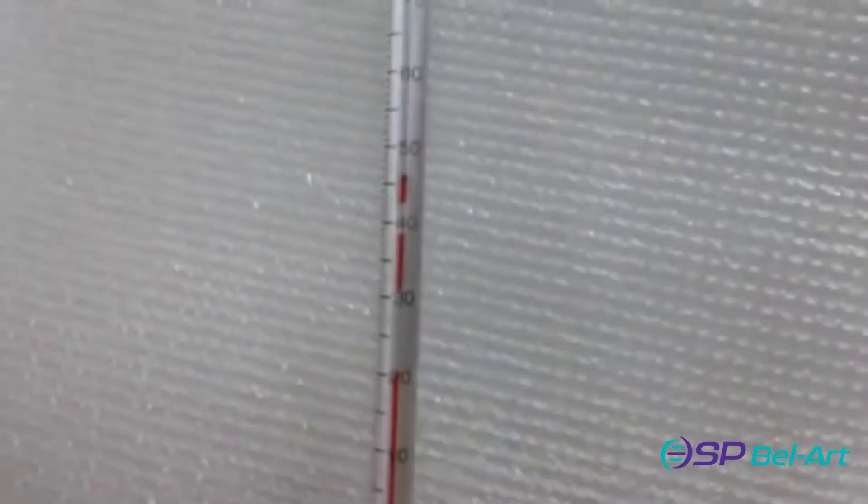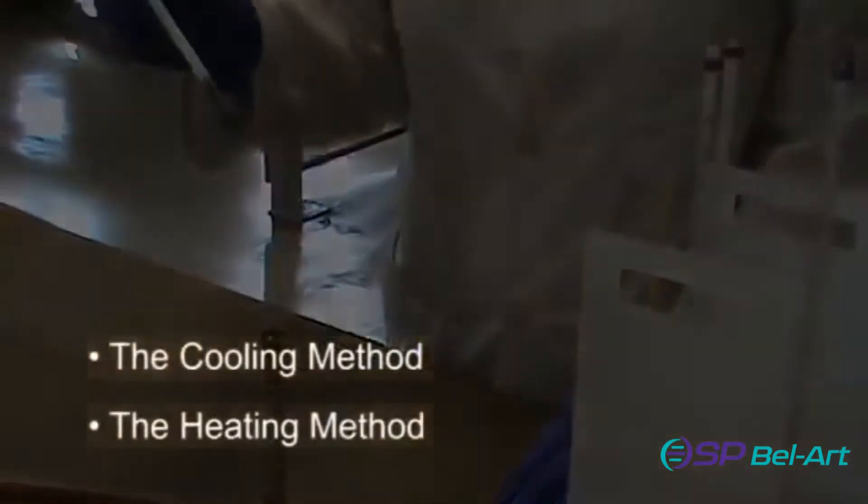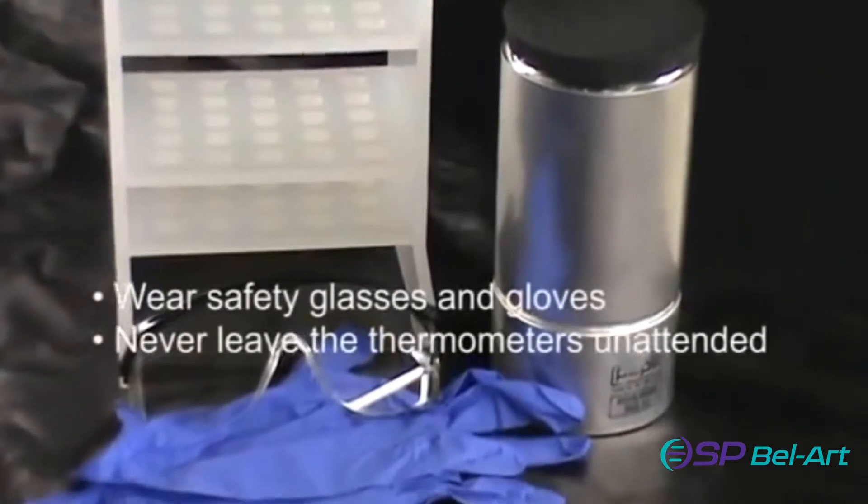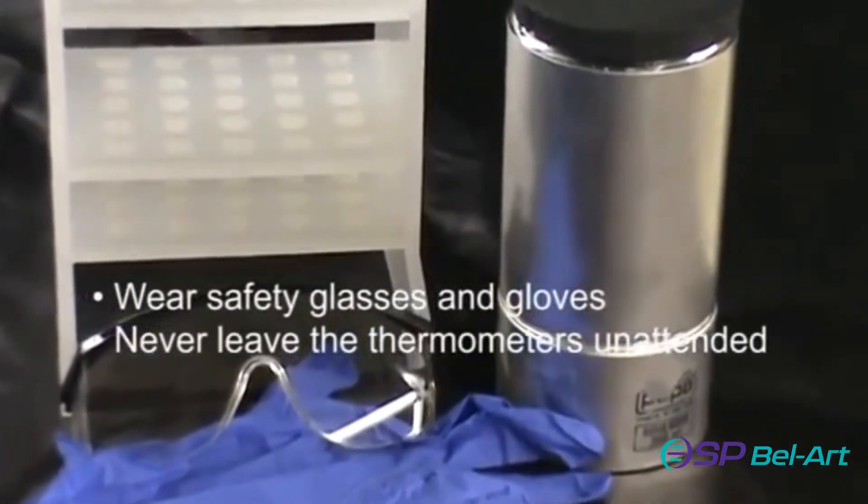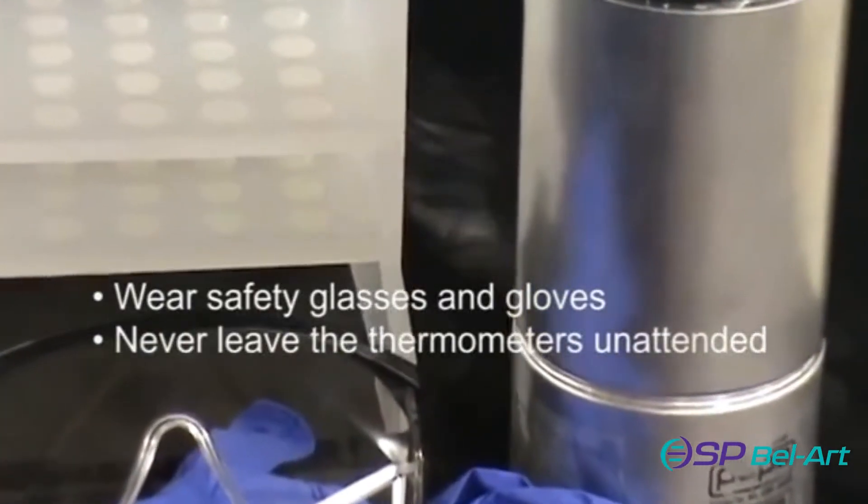There are two simple methods for reuniting separated thermometer liquid: a cooling method and a heating method. With either method, we strongly suggest you wear safety glasses and gloves and never leave the thermometers unattended while working with them.